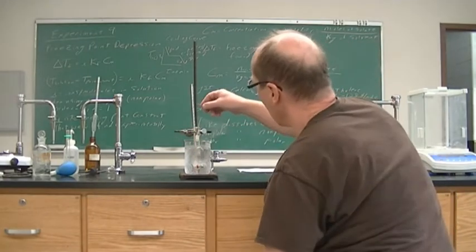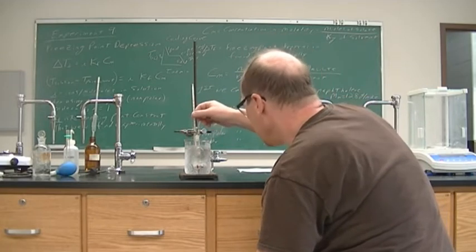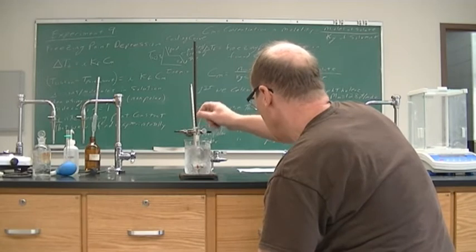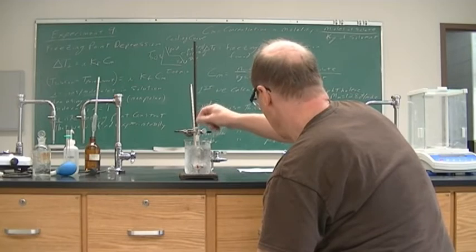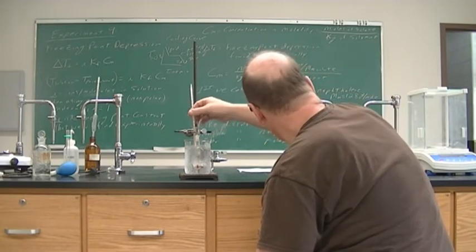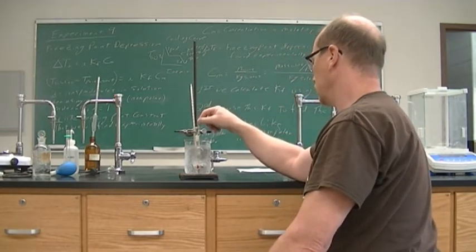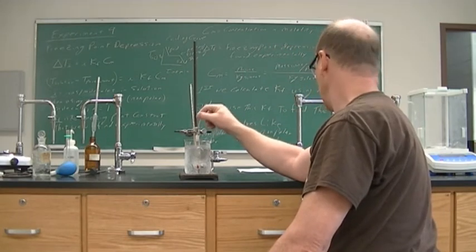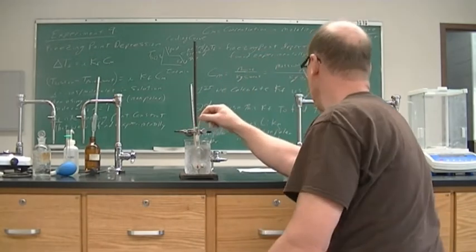Not seeing any solid being formed yet. Another 15 seconds. We are at 11. All right. Another 15 seconds. We're at 10.5. Another 15 seconds, we're at 10.